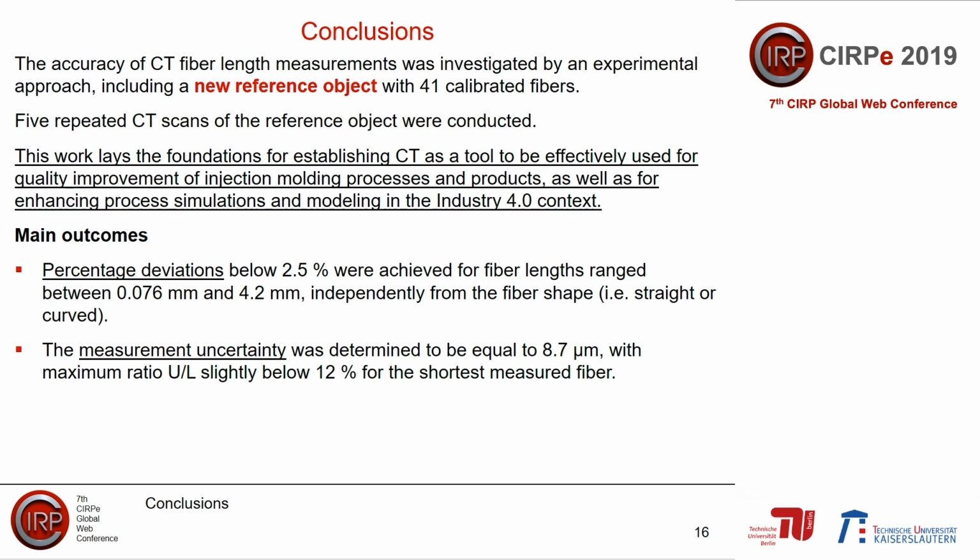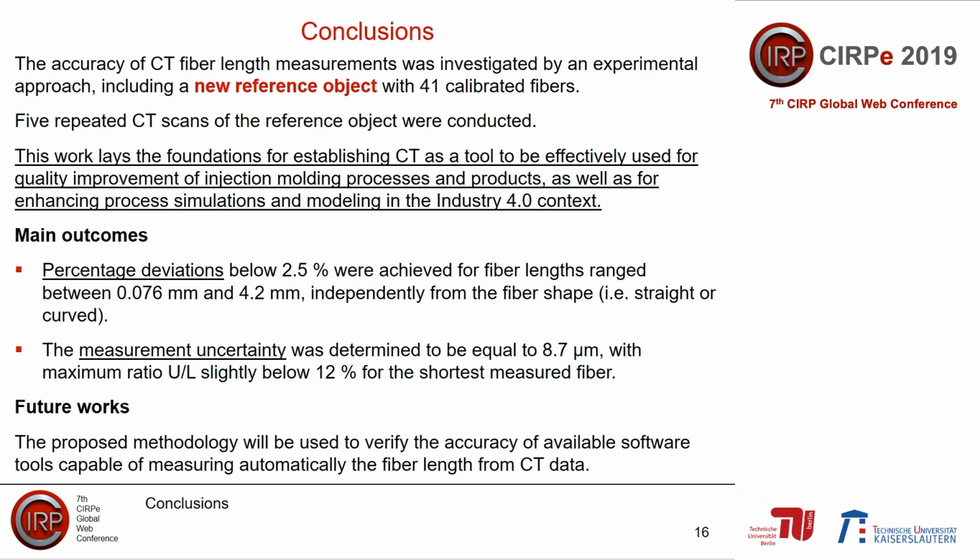In this work, the fiber measurement was operated manually by the elaboration of CT data. Hence, future works will be focused on applying the proposed methodology to verify the accuracy of available software tools capable of measuring automatically the fiber length from CT data. In addition, the proposed approach can be easily extended to other composite materials.